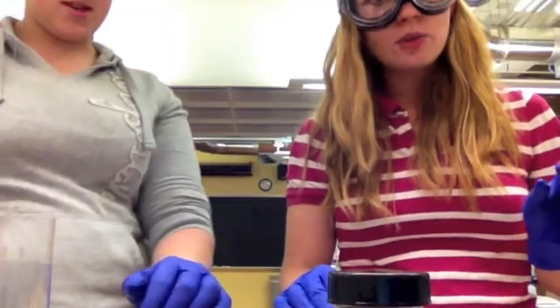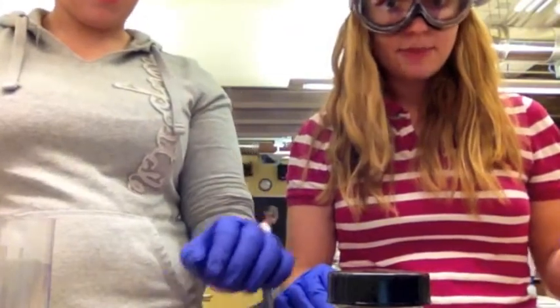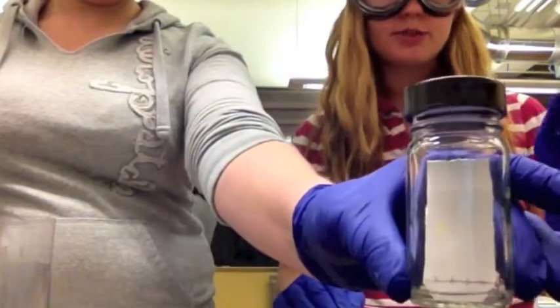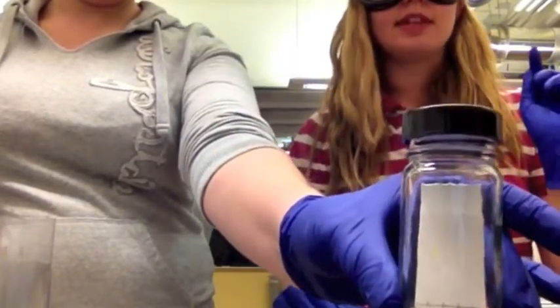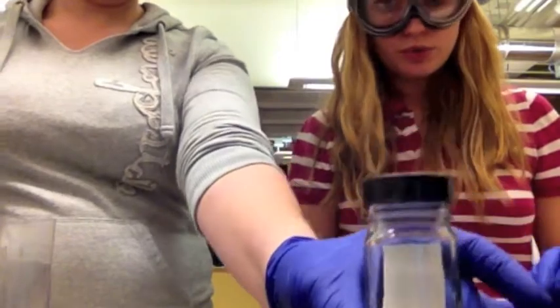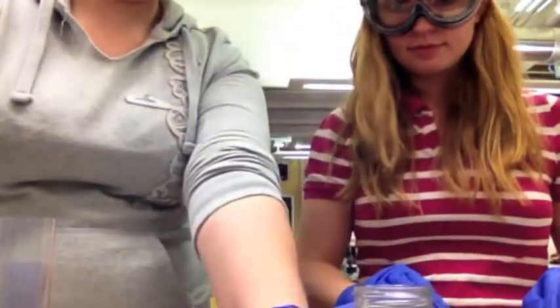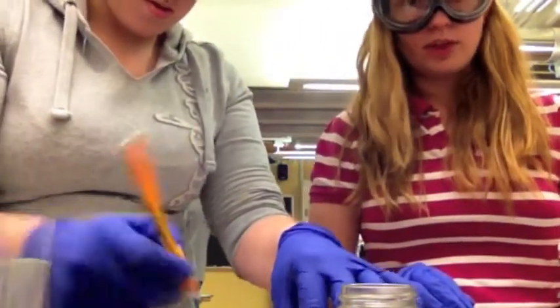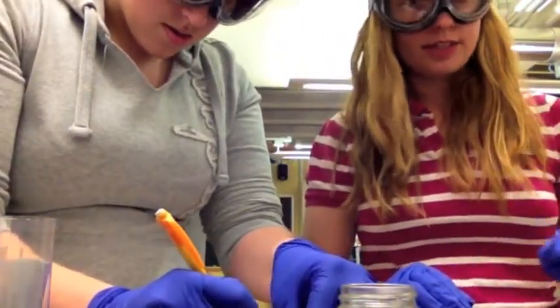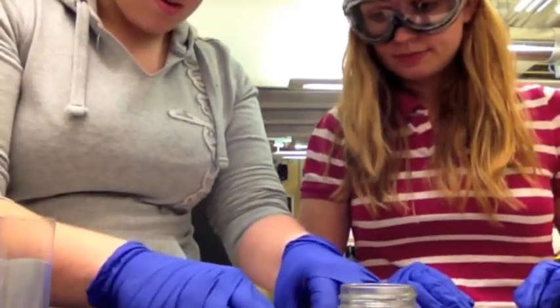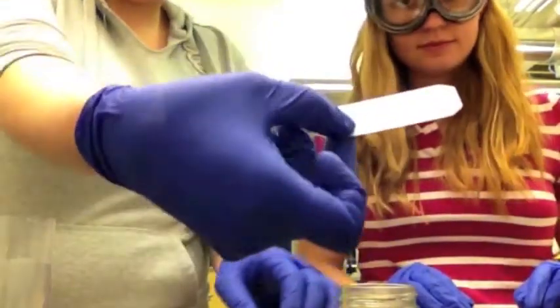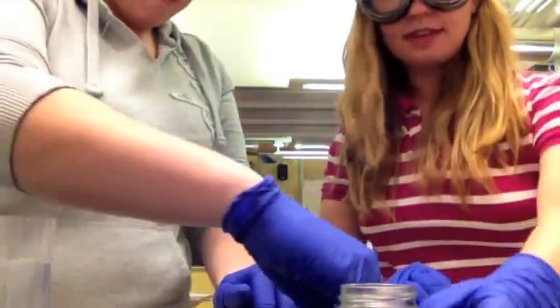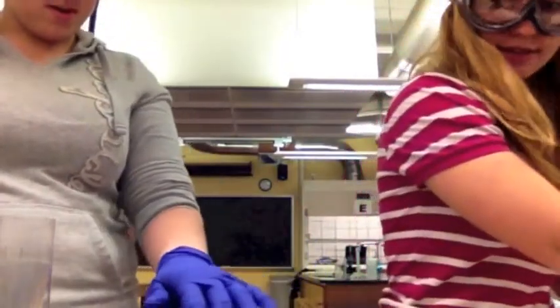After you wait for a while for your plate to develop, after it reaches about three quarters of the way up the plate, then it can be carefully removed. Immediately after removing, draw a pencil line along the top of the solvent. Now we will allow it to dry for just a second.